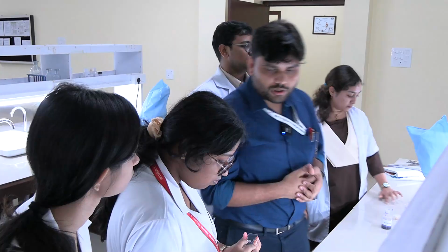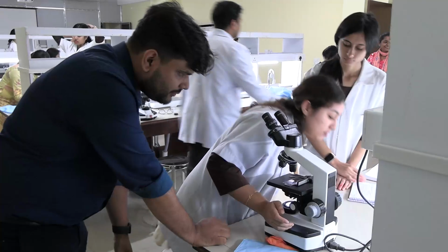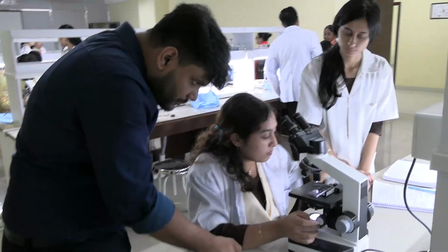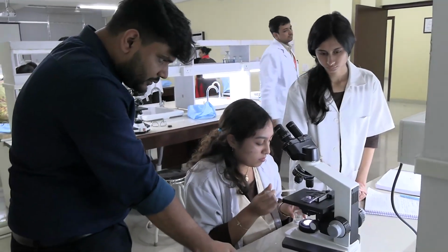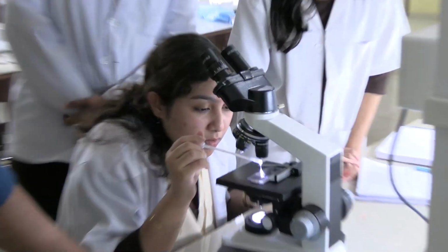Okay. So the rest of you guys can start now. Both of you can start. You can sit here. You can fix the smear on the field where you are getting the optimum coverage. Just drop one drop. I think that's enough.